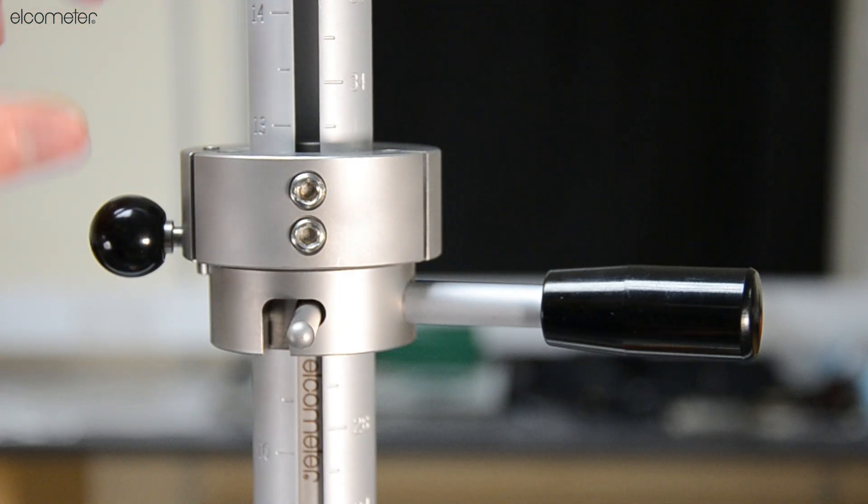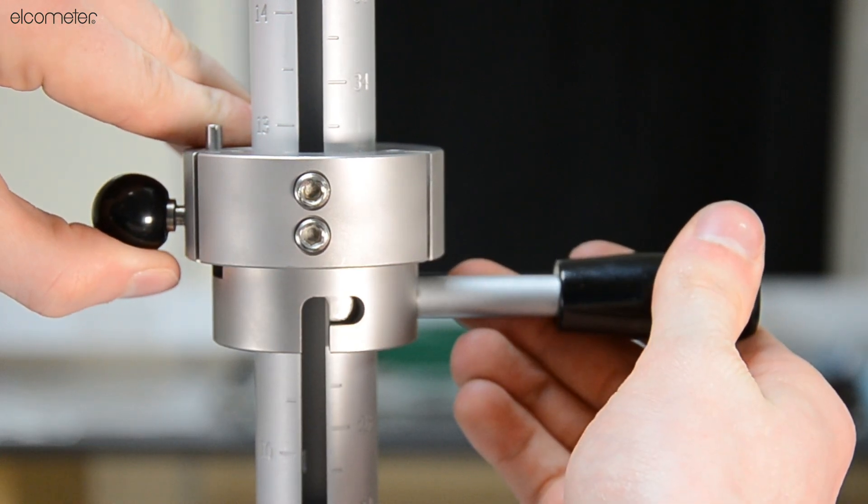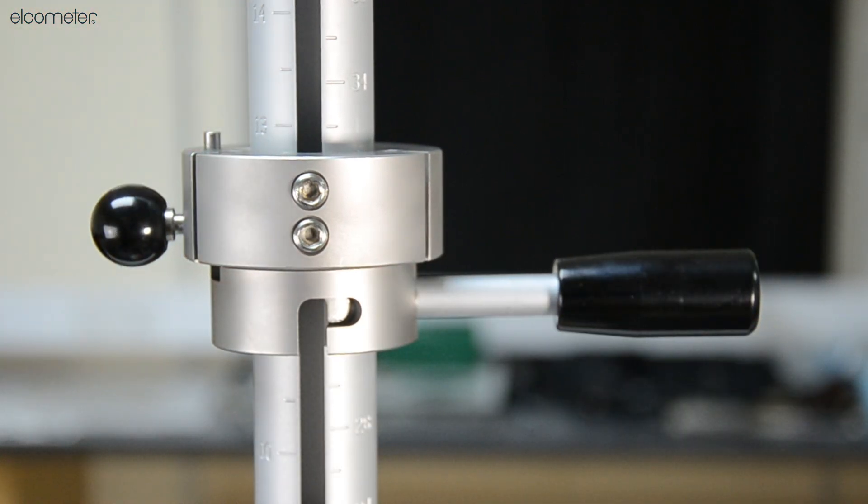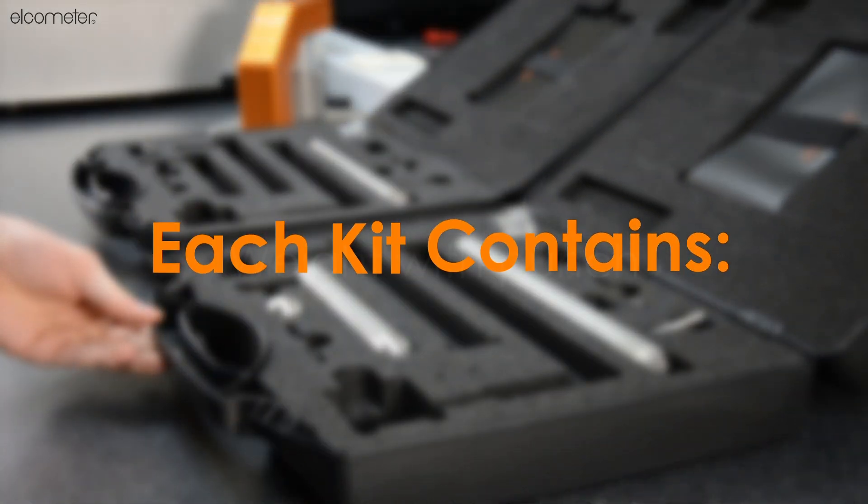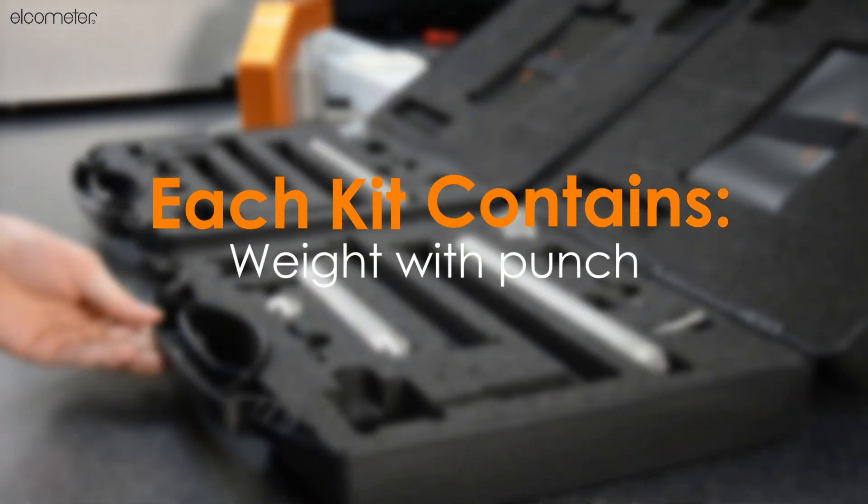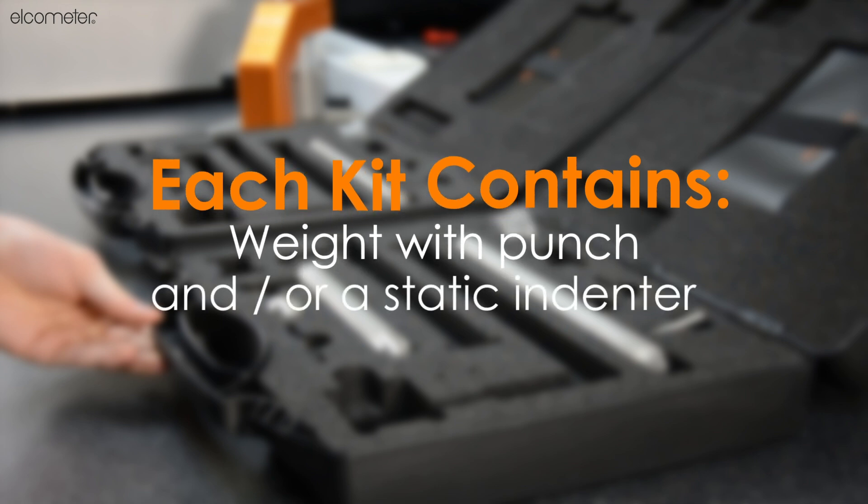The height from which your weight is released is defined by the particular standard you are working towards. Each kit contains a weight with an attached punch and/or a static indenter. The punch and indenter define the degree of deformation at the point of impact.